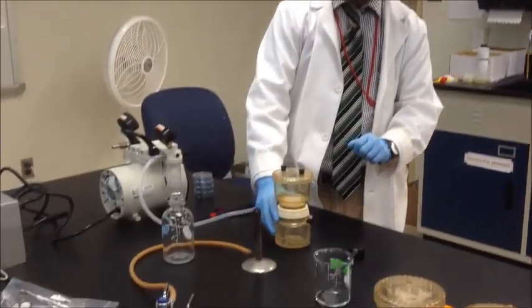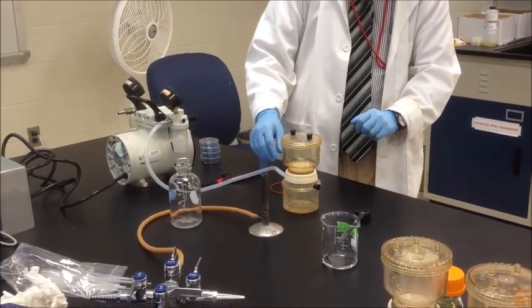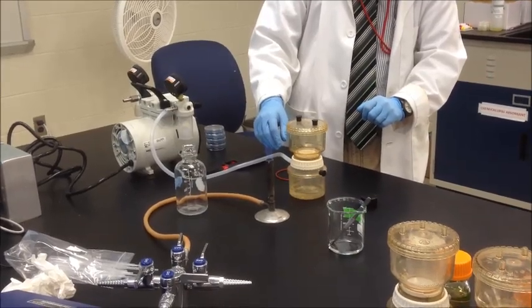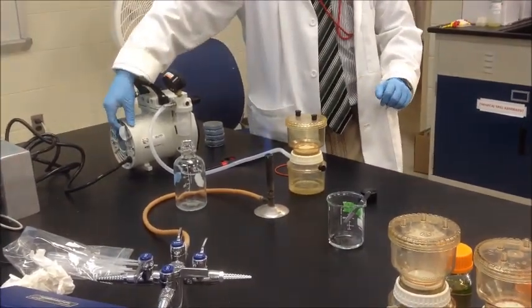So we're going to let this run until all the water has passed through. Turn that off.